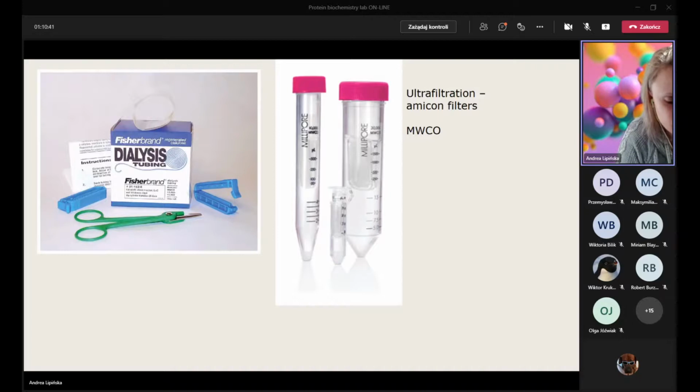They are usually based a little bit on the theoretical knowledge or explanation of the procedures, what happens during the lab. Sometimes small troubleshooting, like I'm performing Western blotting, I have no bands. What could go wrong? Or I'm performing Western blotting and I have many bands. What's the reason for that? Or we are purifying lysozyme and we have no lysozyme in our fractions. What's the potential reason? Okay, so there are usually several explanations.